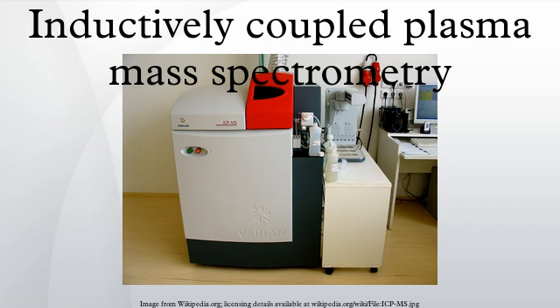A flow of argon gas is introduced between the 2 outermost tubes of the torch and an electric spark is applied for a short time to introduce free electrons into the gas stream. These electrons interact with the radio frequency magnetic field of the induction coil and are accelerated first in one direction, then the other, as the field changes at high frequency. The accelerated electrons collide with argon atoms, and sometimes a collision causes an argon atom to part with one of its electrons. The released electron is in turn accelerated by the rapidly changing magnetic field.